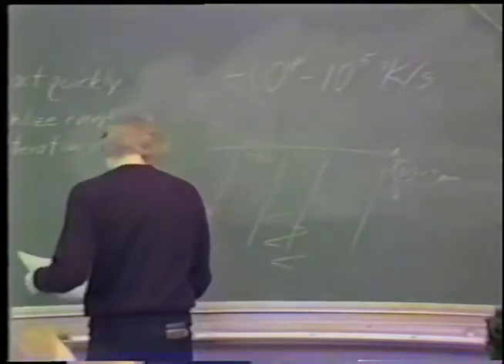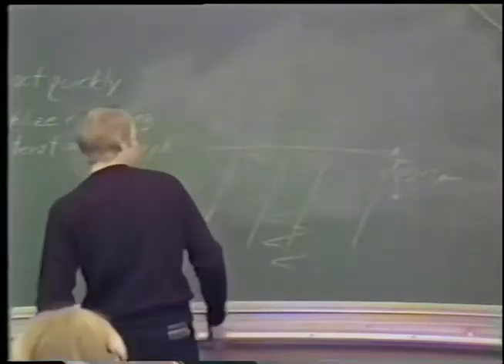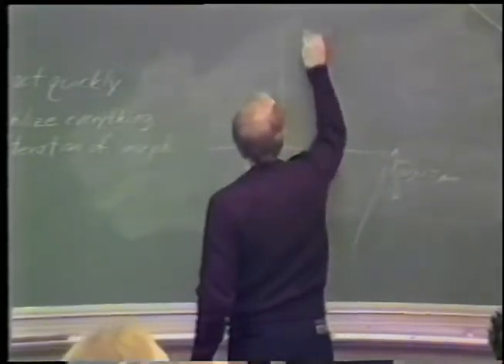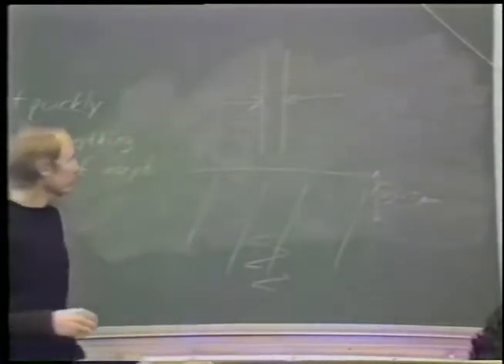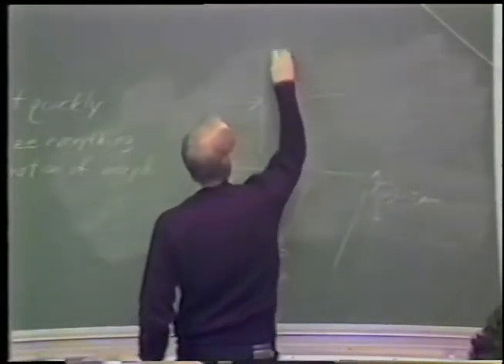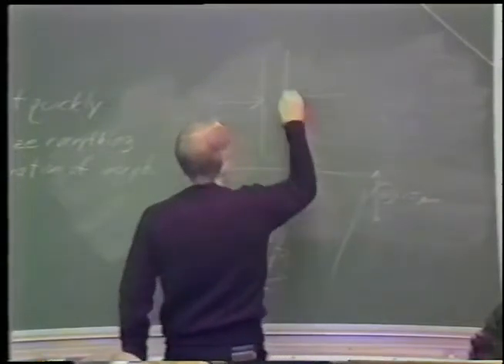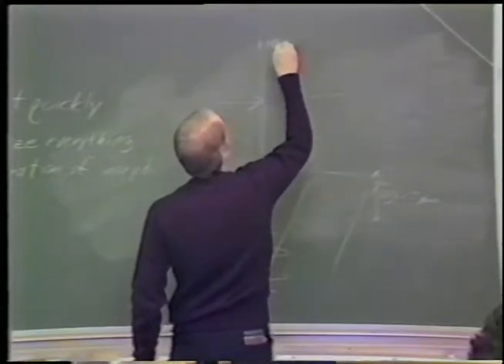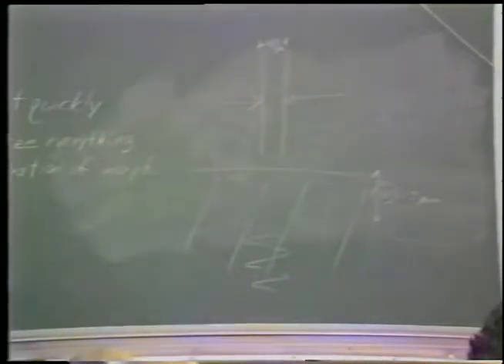Now, let's suppose that instead of having a very thick sample and cooling from only one side, we have a thinner sample and we cool from both sides. In that case, since you're cooling from both sides, you can withdraw heat from the interior quickly enough to freeze a sample to about 40 micrometers total thickness on the average.